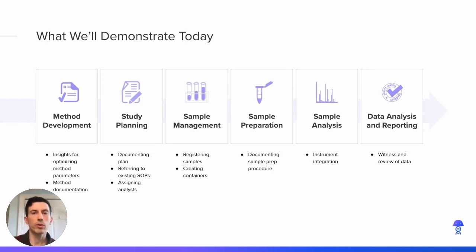Completion of this workflow really requires the software to be both structured and flexible. The flexibility is essential while this method is being iterated on in this first stage. And then once that method gets established and validated in some instances, the processes become more structured and the method is standardized to capture and report on those preclinical findings.